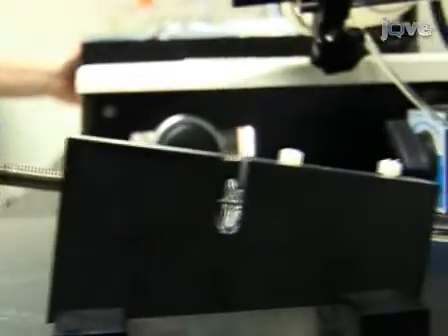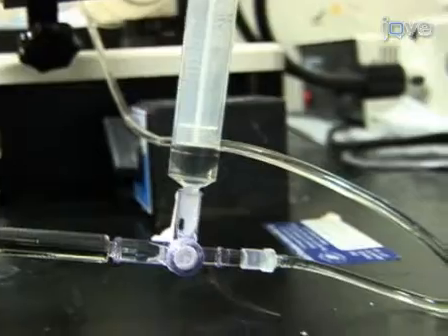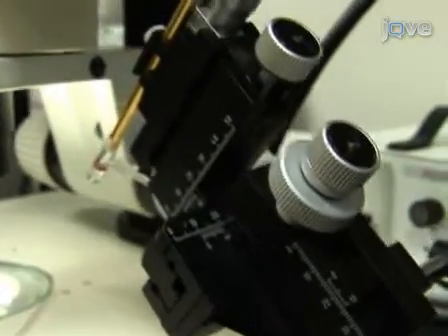The apparatus used for cell transplantation in the zebrafish blastula consists of a drive-controlled Hamilton syringe attached by a 3-way stopcock to a reservoir of mineral oil and to a micropipette holder through a length of flexible tubing.